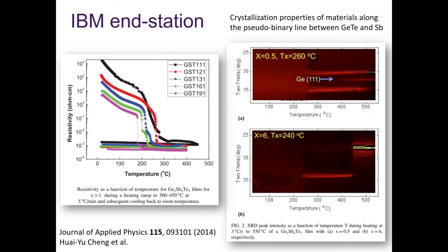One last example, very quick. This one is a germanium telluride thin film with applications in phase change memory because it undergoes the amorphous to crystalline transition. Right here, amorphous to crystalline, and you can see how the resistance drops right at the onset of the crystalline phase formation. So this is the last and third example I brought about the application of the IBM station.